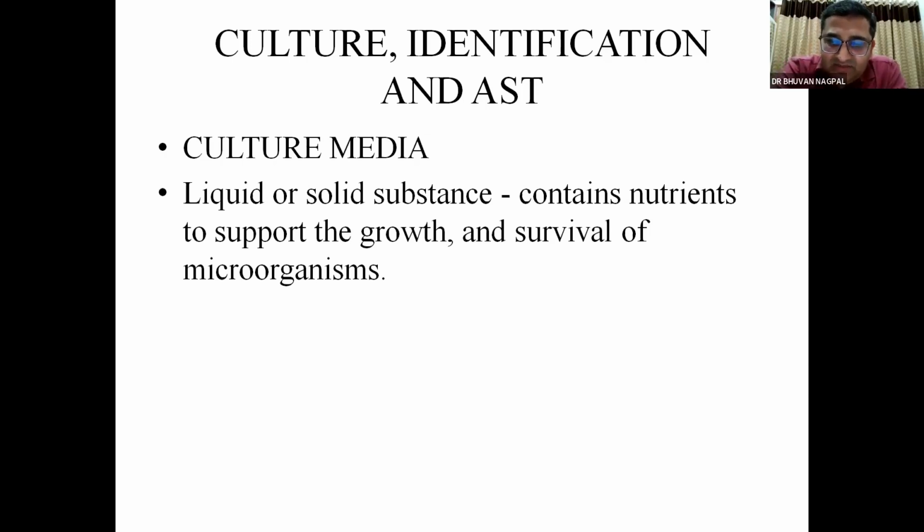Okay. So what happens is, when you inoculate into the blood agar and the potassium tellurite media, you have not seen it in the direct smear, but next day in the morning on the potassium tellurite you will see black colored colonies.